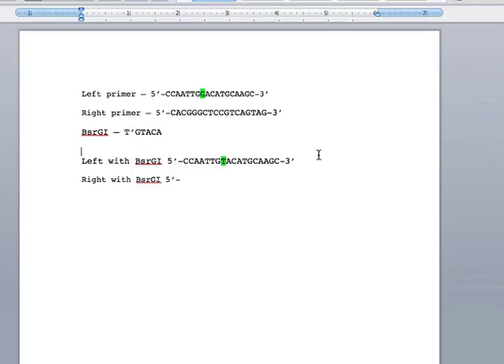Let's type the sequence out and then make the replacements. Oops. So this is the confusing part. Okay, there's the sequence. That's what we got out of the Primer3 software on Biology Workbench. And so we need to change it to TGTACA.